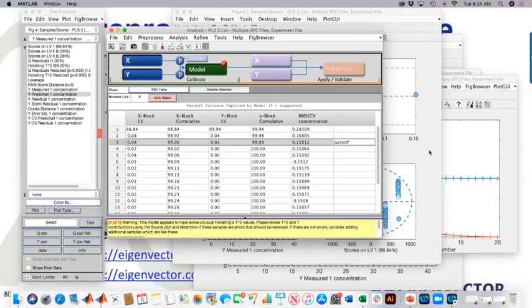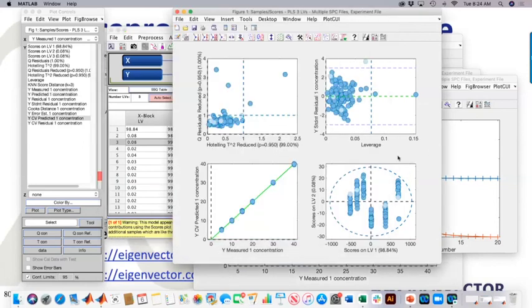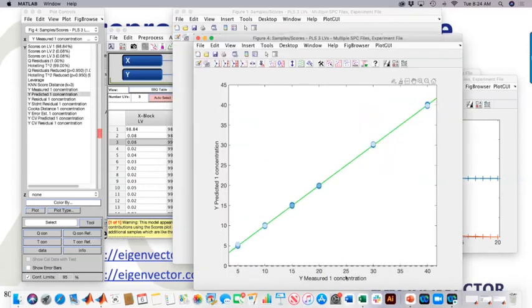One thing that is sort of funny in here is you'll notice that in our measured versus predicted, it actually moved some of our bad samples closer to the line, especially this one, because that was part of the problem with these samples, their baseline offset. So it didn't improve the model overall, but it actually improved its performance on these outlier samples.